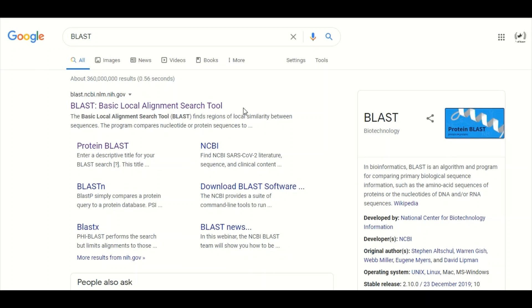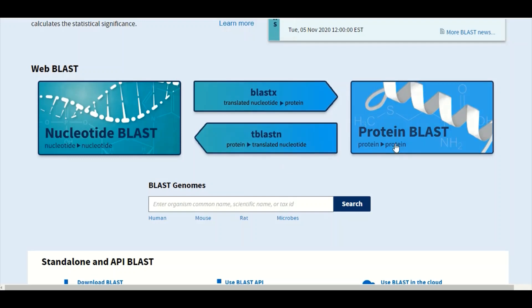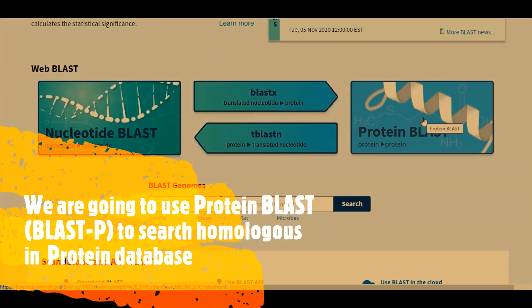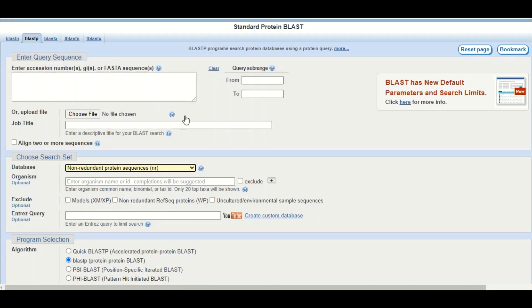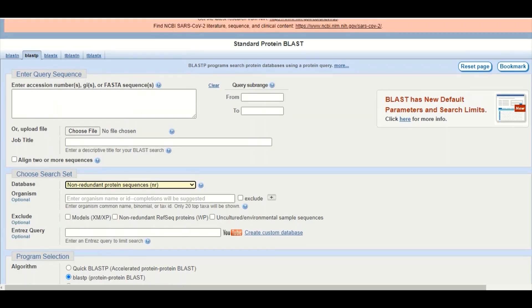The BLAST program is based on the word algorithm, which we have discussed in detail in regular lectures. In this tutorial we are just going to talk about how to use the BLAST program. To access the BLAST program you need to click on this link, which will take you to a page showing the different types of BLAST programs available. We are going to use protein BLAST, so we will click on the protein BLAST tab, which takes us to the page dedicated for BLASTP.